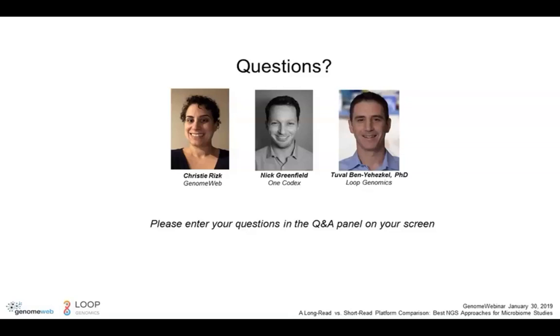Yeah, so I'm just writing those down. On the sample collection side, in the scope of this webinar, there wasn't any, right, because these input standards were gDNA. So nothing in the context of these known communities.